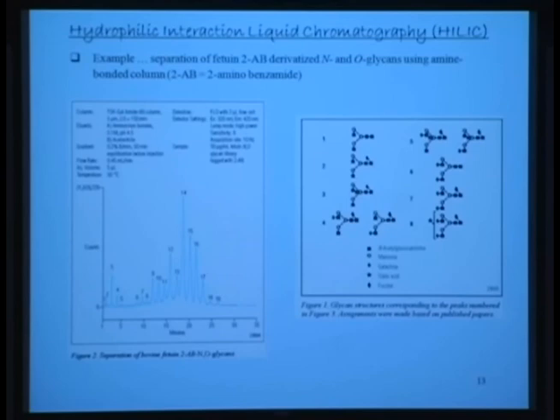This is, what sample is it? This sample is IgG somewhere. Sample 50 micrograms per milliliter of fetuin. It's 50 micrograms. And you can actually identify several peaks, and most of these have been characterized, once again, using mass spectrometry.